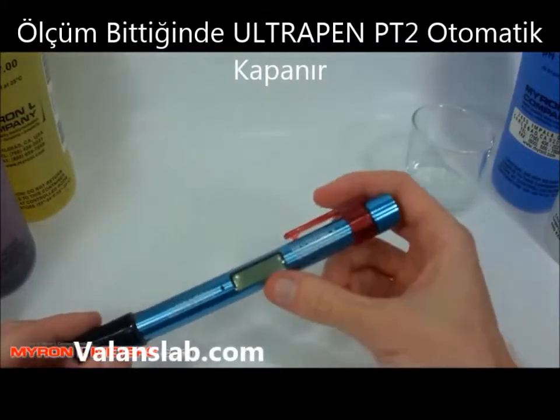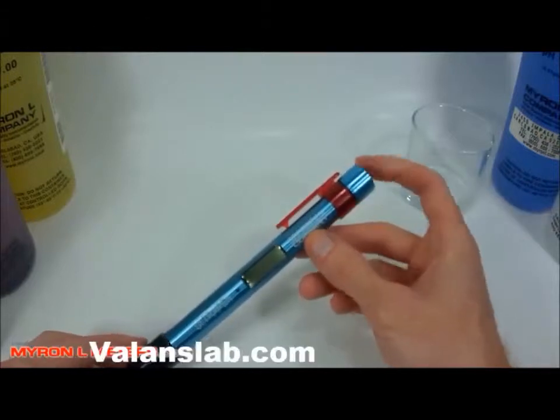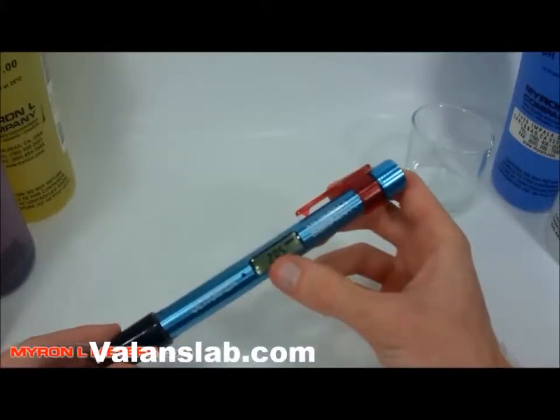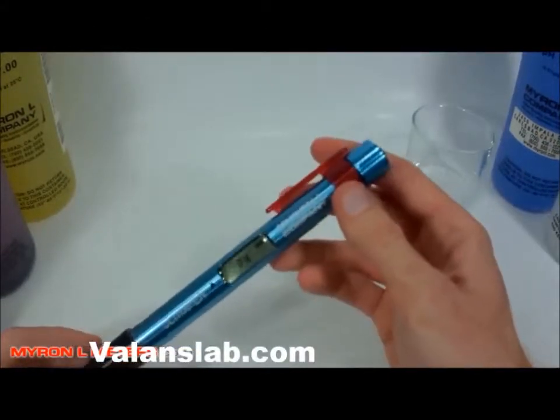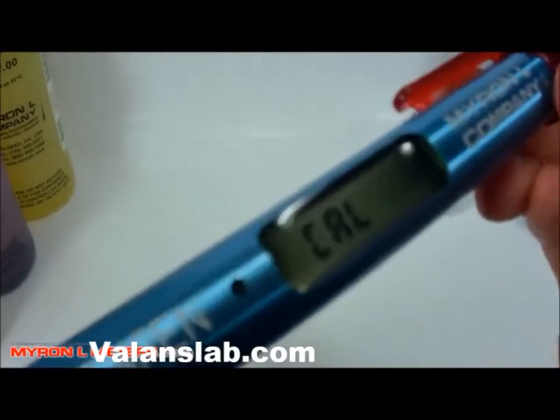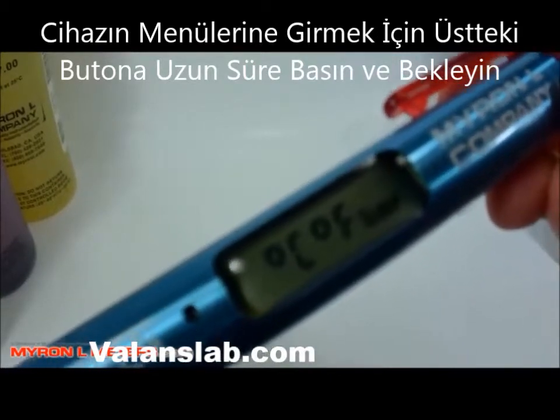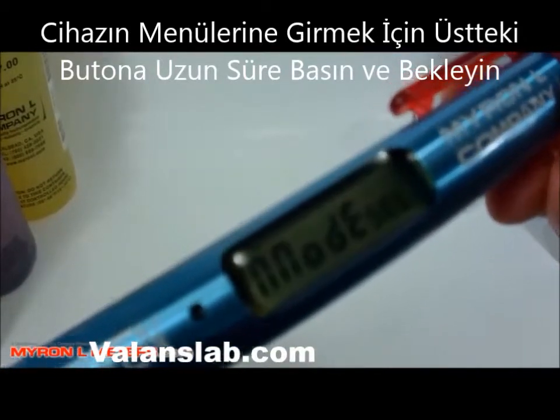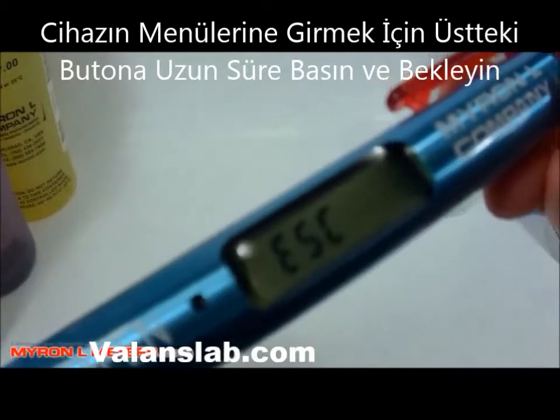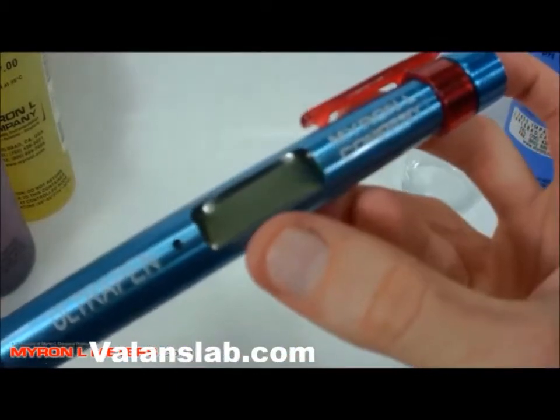The instrument just automatically turns off. To go through the different menu settings, when it starts to take a measurement, you simply press and hold the button and it will start to scroll through the different menu options. We have calibration, factory calibration, Celsius and Fahrenheit selection, pH mode selection, and then escape. If you release the button on escape, the instrument just turns off.